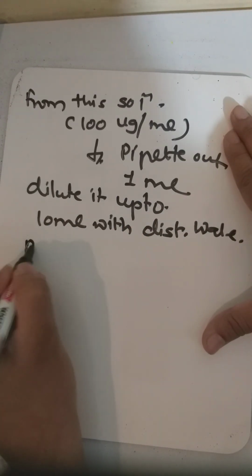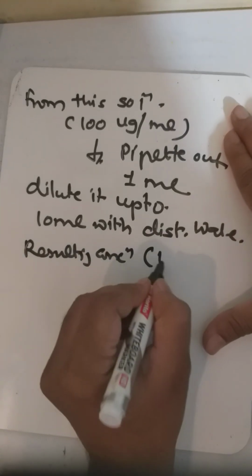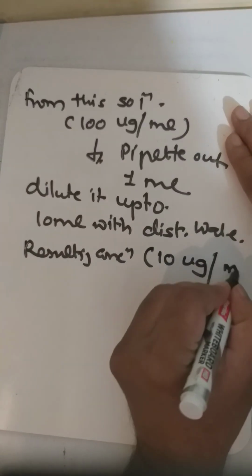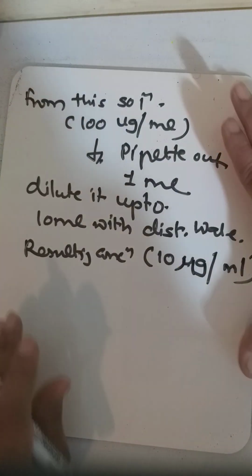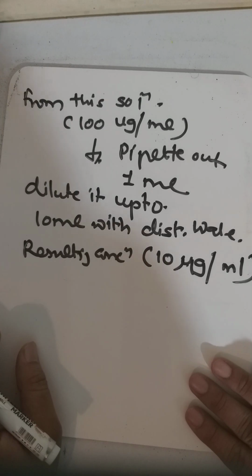So the resulting concentration would be 10 microgram per ml. Okay. So these things are there. Now what do you have to do?